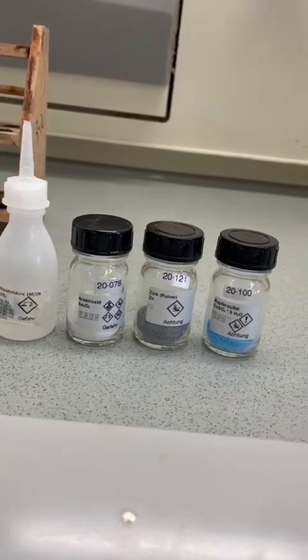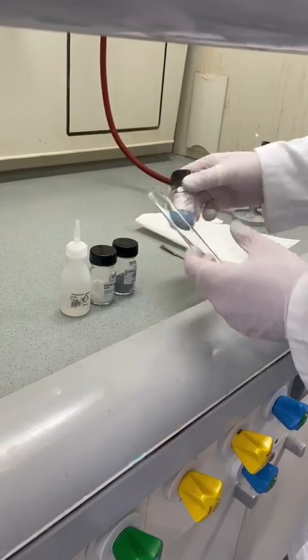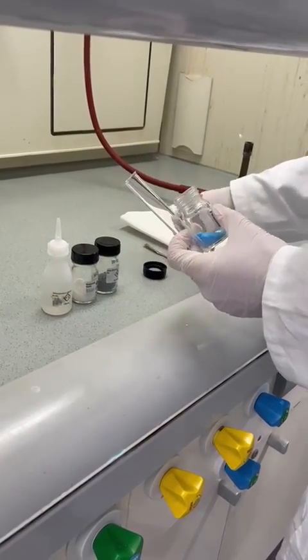In this video, arsenic trioxide and its volatile trihydride are handled. They both are extremely toxic and can kill you, so working in a fume hood is a must.